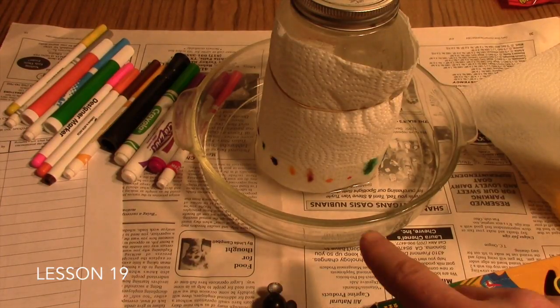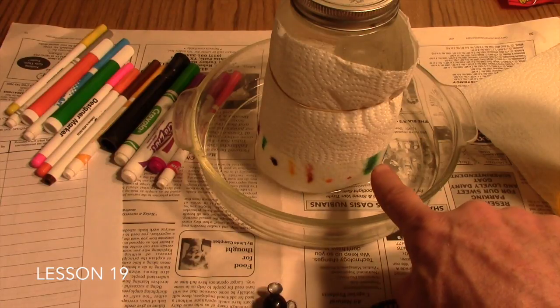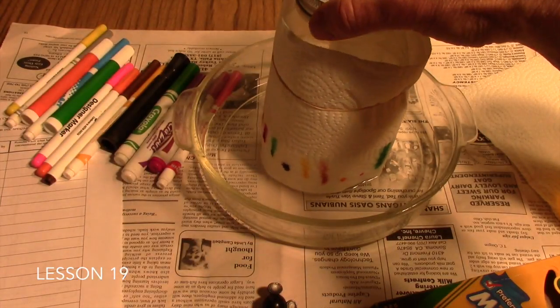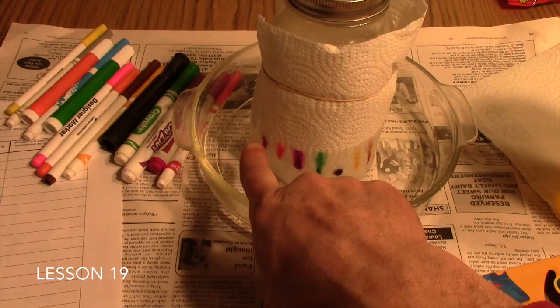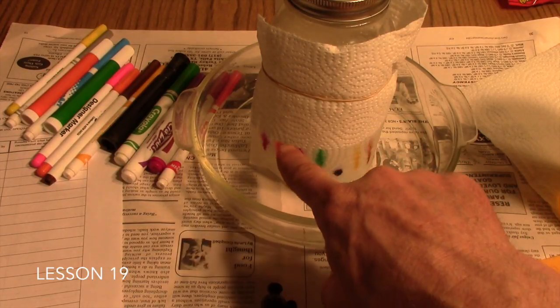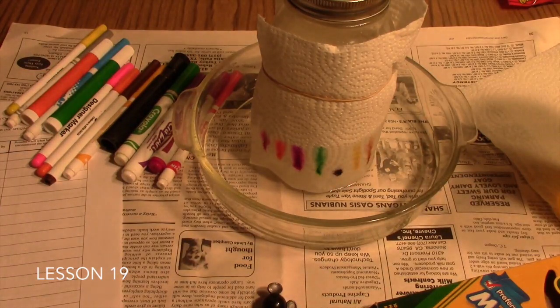Okay, and you can see here now the water is moving rapidly up into the paper towel. I'll rotate it around here and you can see this is what's called the front. That's where the water line is, and you can see the action there on the inks.